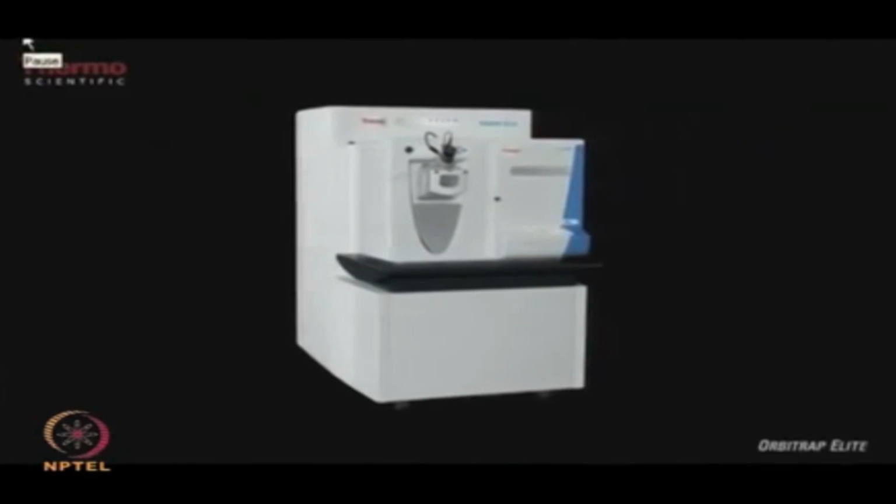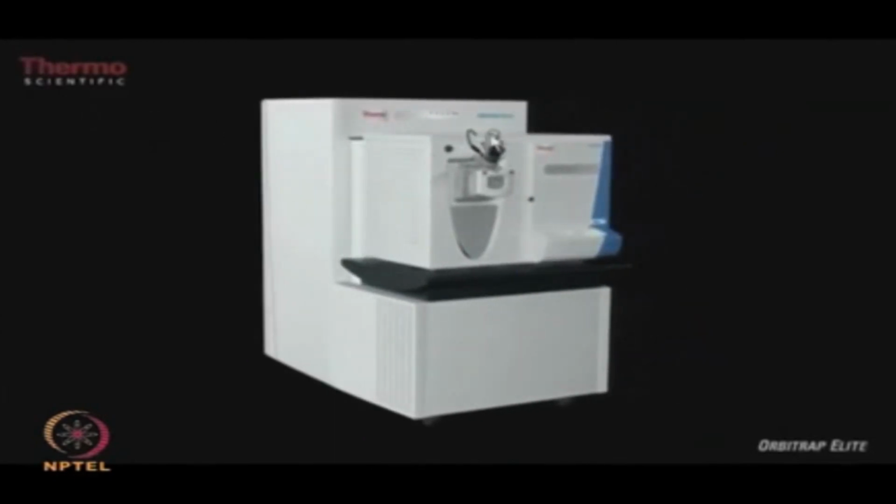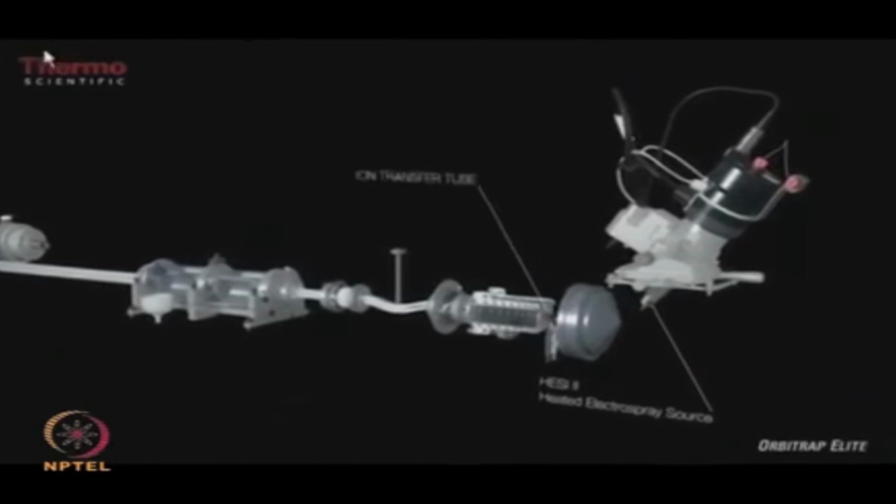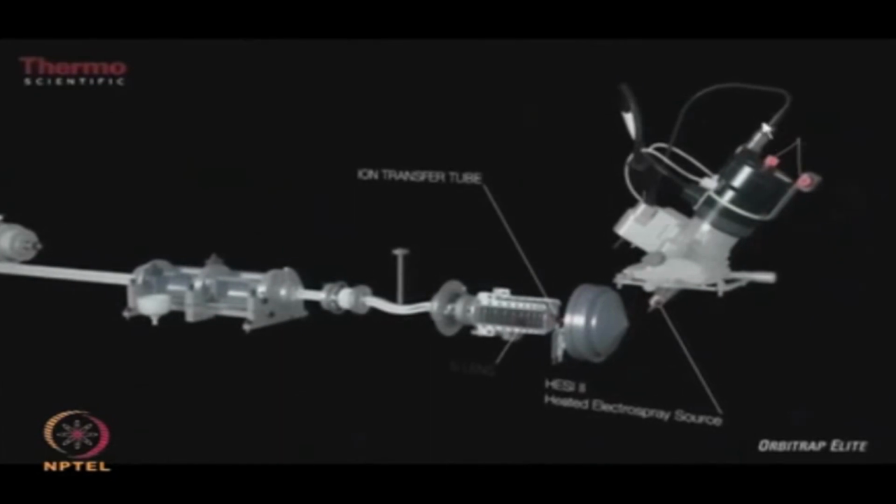The mass spectrometer sitting in front is a linear trap, the LTQ Orbitrap Velos, and the back end is the high field Orbitrap, called the Orbitrap Elite. If you look at the schematic of the system, in the front part of the system is the ionization source, which sits at the front.